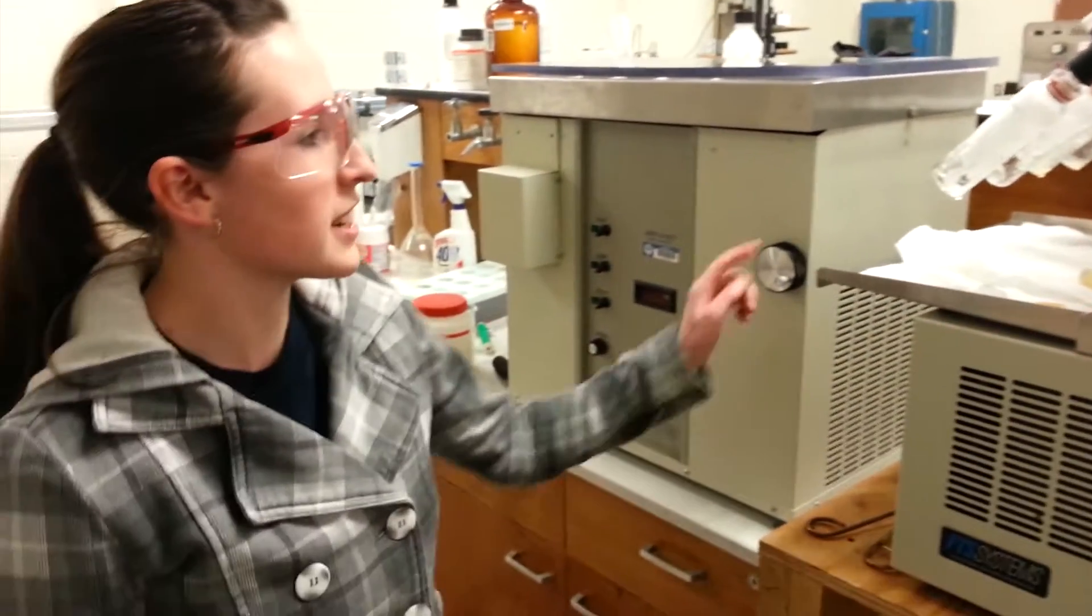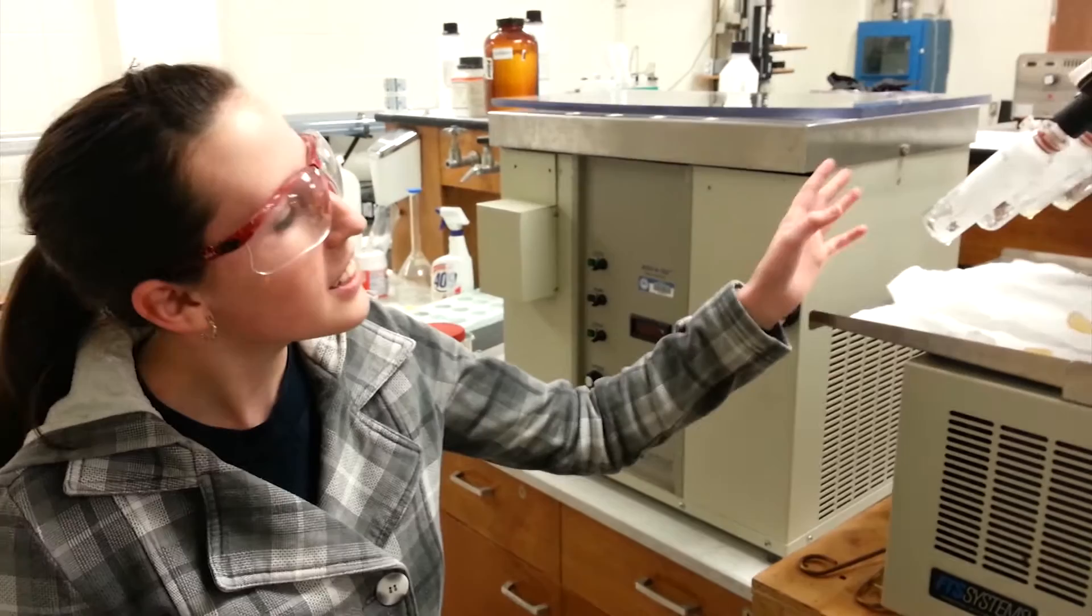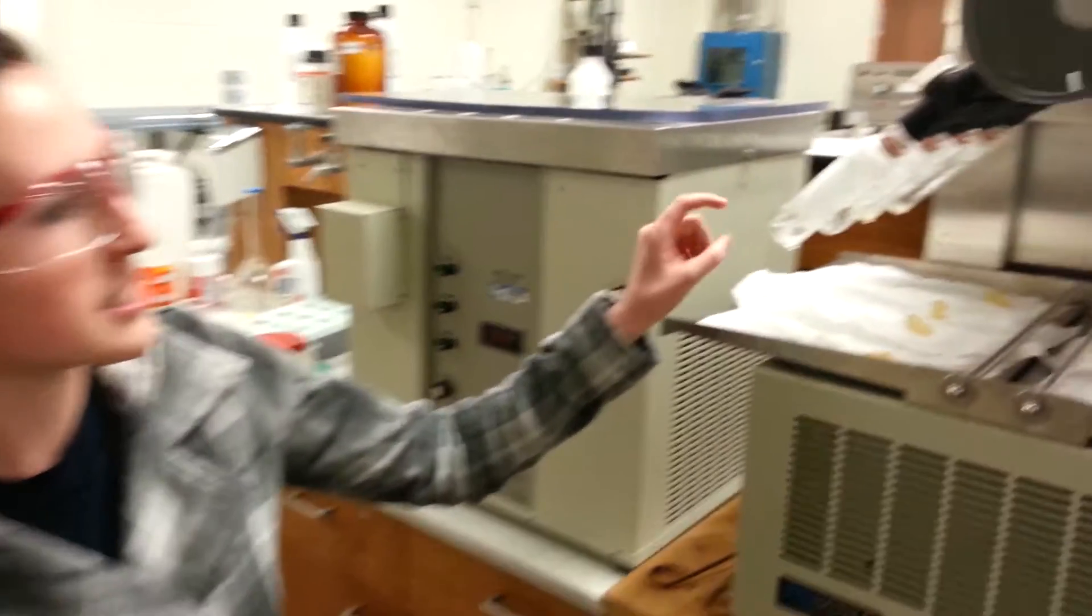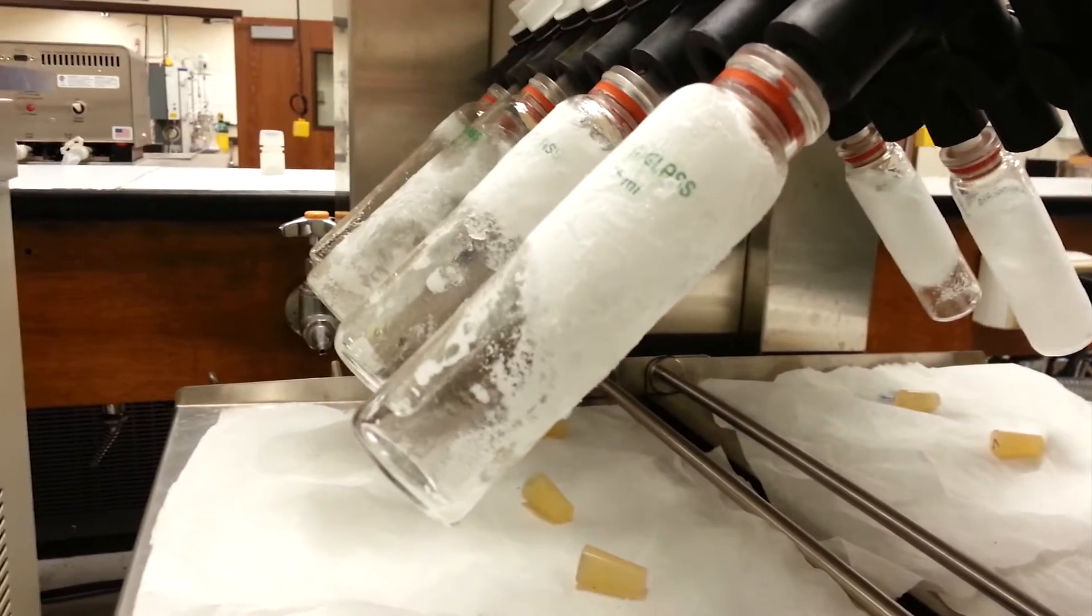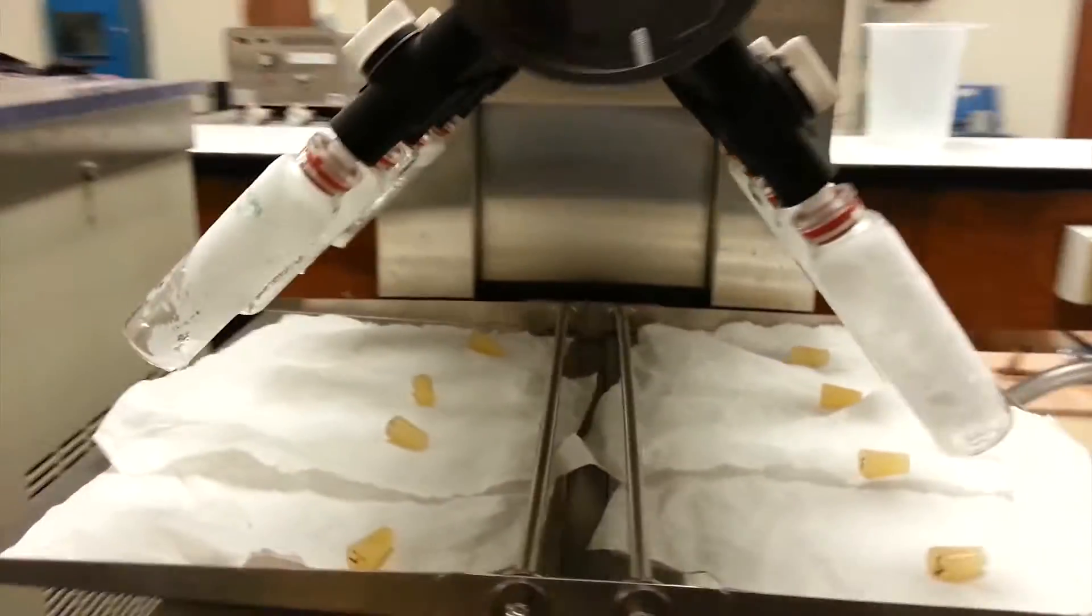And so it all gets frozen here and as you can see, the water is subliming out of these and being extracted. And we just take samples to determine how fast that happens.